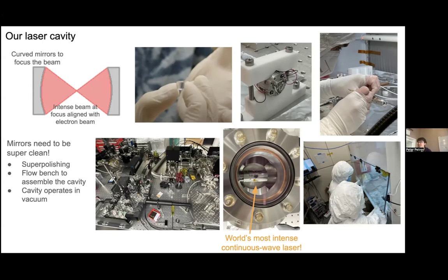Yes. What material is the mirror? It's made of, what is it? The special glass, the ultra low expansion glass. It's a product that's designed to minimize thermal expansion, because there's so much light hitting the mirror that thermal deformations are a big issue. And then it's coated with a stack of two materials that have different refractive index and make a sort of reflective grating.